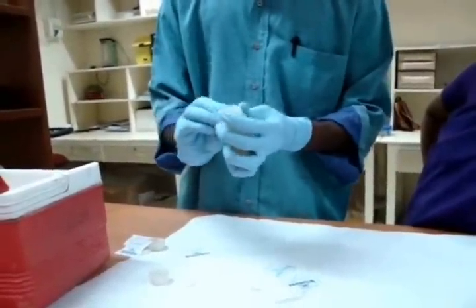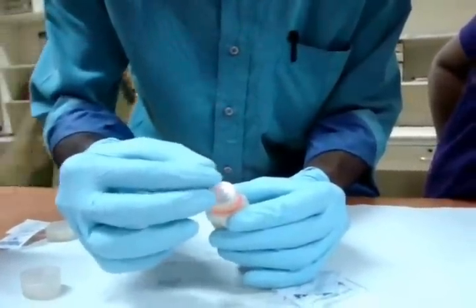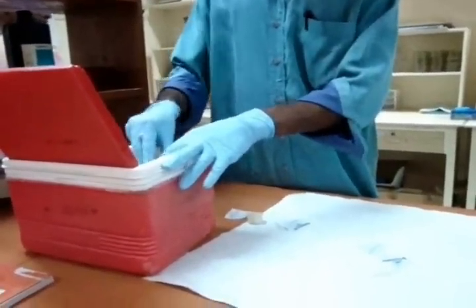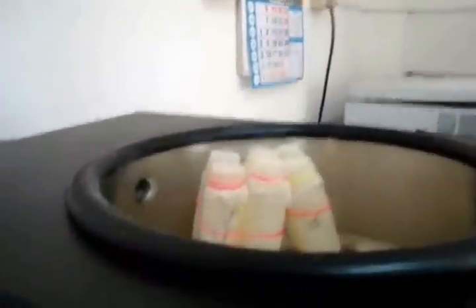The stored samples are then prepared for lyophilization. The tubes are covered with parafilm sheet and pores are made for lyophilization. The tubes are then transferred to the lyophilizer.